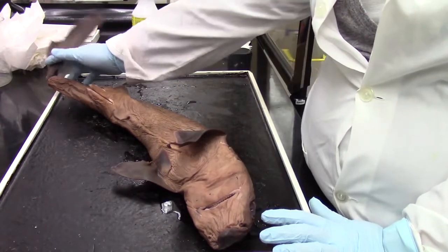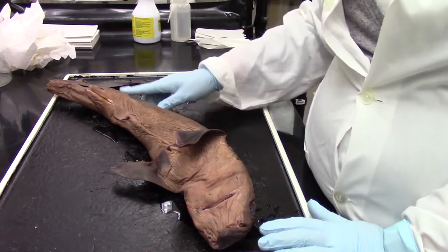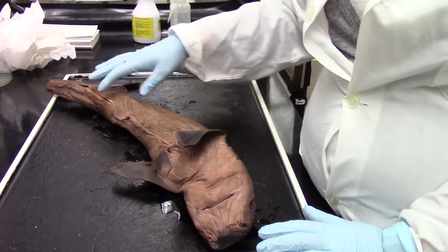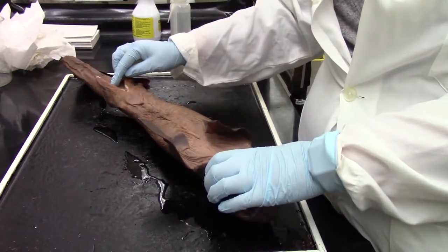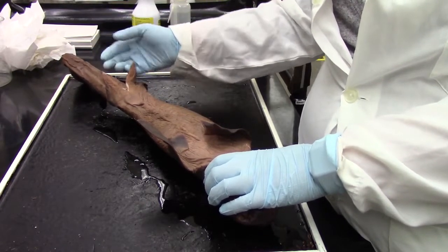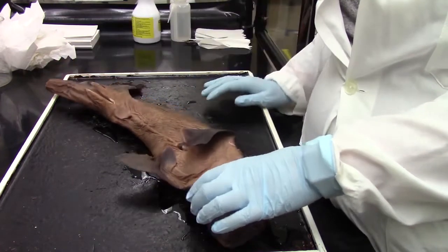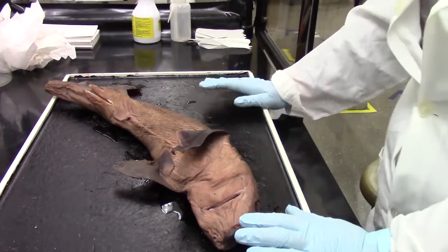We can see that the tail is broken, and that's just something that tends to happen when they package up these larger animals. I also want to note that the animal's vent is going to be right between the two pelvic fins. So a fin type that's actually missing from the dogfish is the anal fin. So some sharks have an anal fin, dogfish do not.